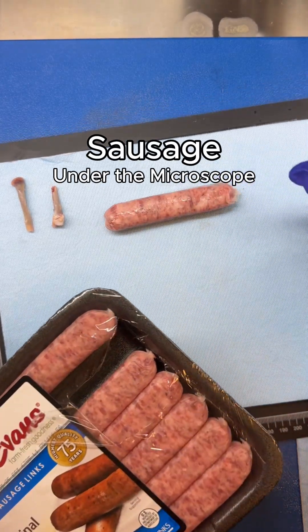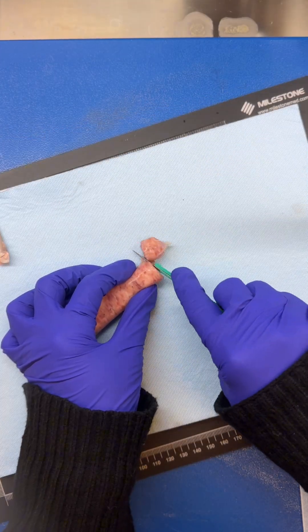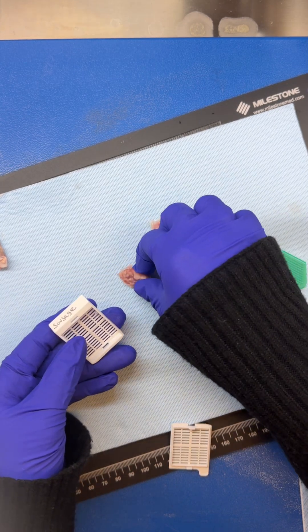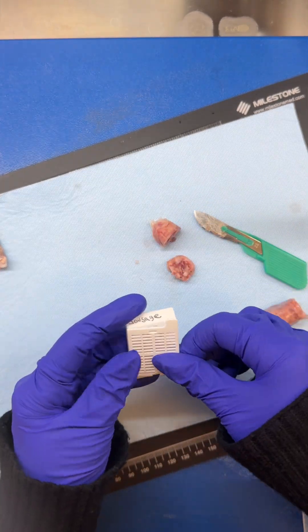If you want to see what sausage looks like under the microscope, stay tuned until the end of this video. Let's take sausage from the grocery store through the tissue processing steps as we would a sample from the human body.